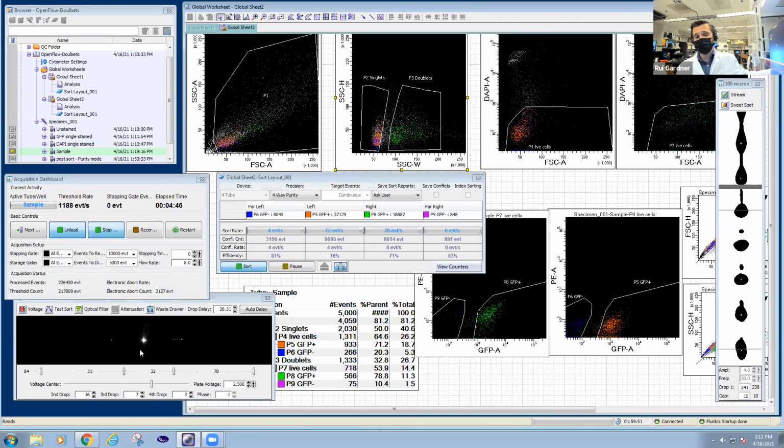Again, it's a laser that's beneath the plates, and it's not measuring anything at the moment. It is used to measure the AccuDrop, so the timing between the lasers and the breakoff point. When you're measuring, you want to fine tune it so that you maximize the number of flashes, the fluorescent signal coming out of those drops and those beads. But once you've measured that, you can adjust it freely, because it's not interfering with any measurement.